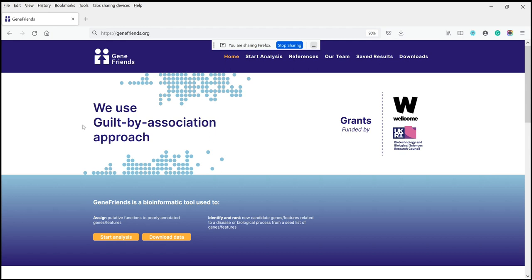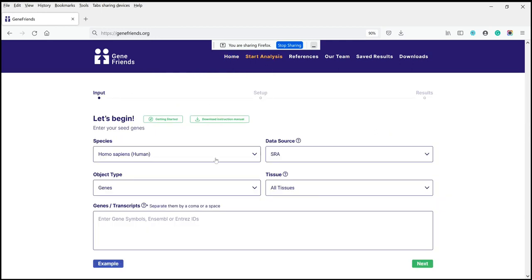This is the main page of GeneFriends, and in order to start an analysis, you simply click on 'Start the Analysis'. This will open various options.